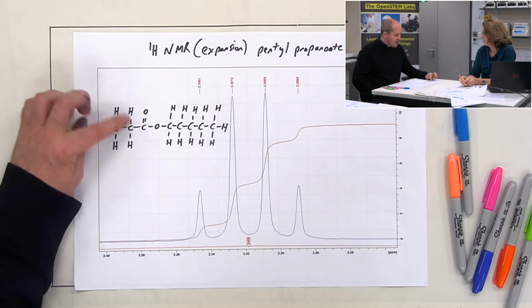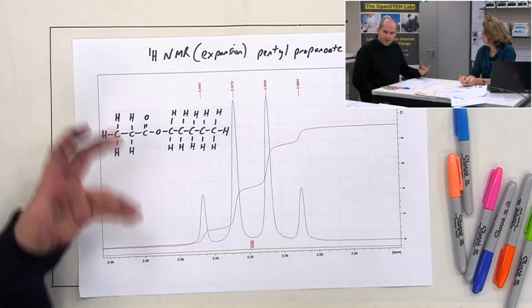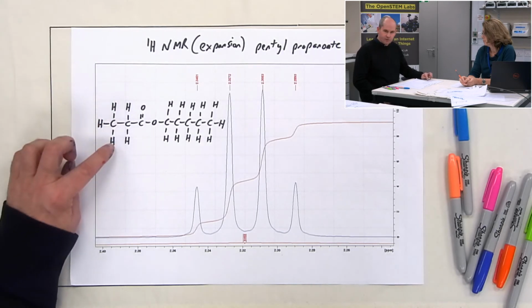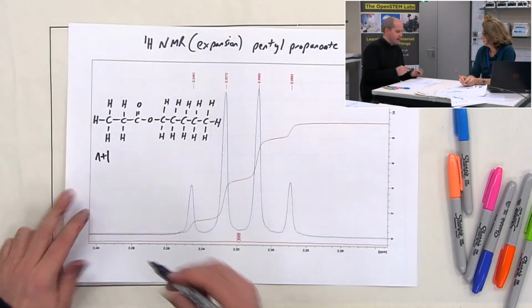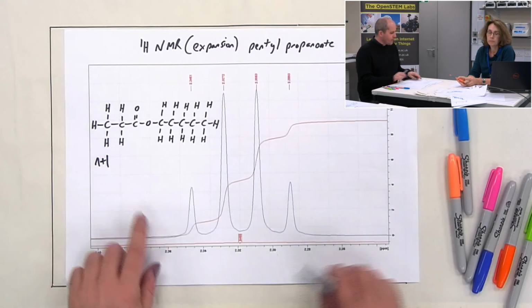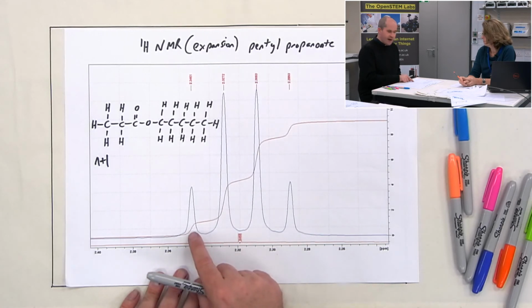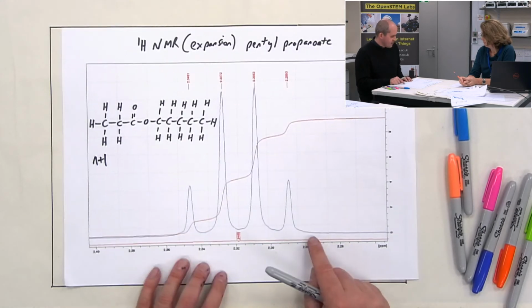We're looking at the adjacent protons that are close enough that they can interact with these protons to split the signal. So we've got 2 hydrogens there, and they are adjacent to a CH3, so they're adjacent to 3 protons. Using our n+1 rule, n is 3 this time, so 3 + 1 is 4, so this signal will be split 4 ways. So we see a quartet consisting of 4 lines, and they've got this characteristic 1 to 3 to 3 to 1 intensity ratio, so that's that one.